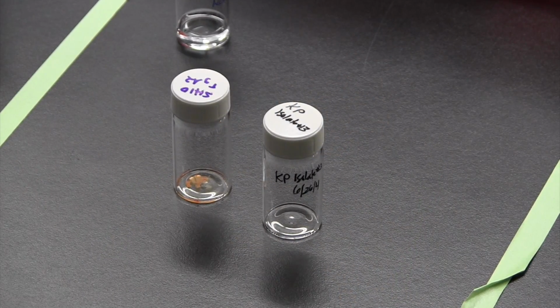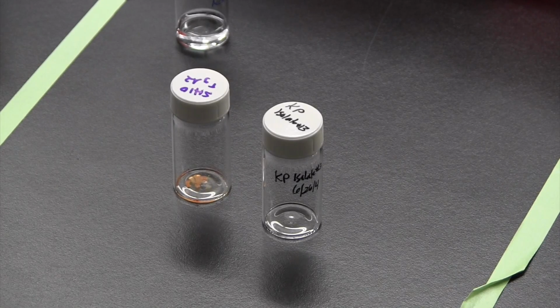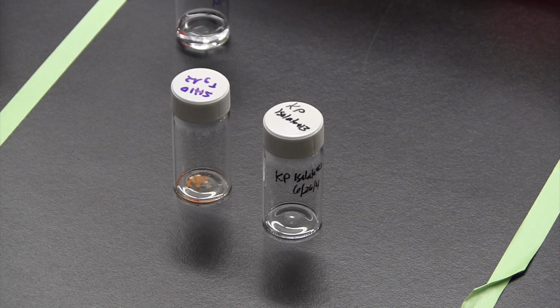Okay, so we are now entering the last phase of our chemical extraction that we've done here at the Small World Initiative. At this point, our organic layer has dried down in the hood for at least 24 hours.